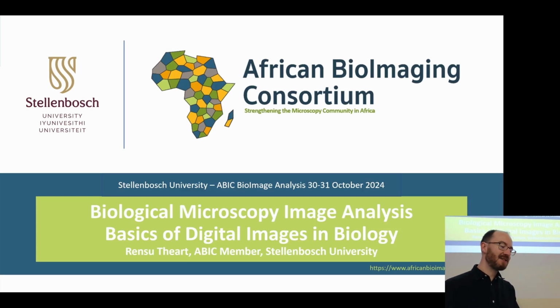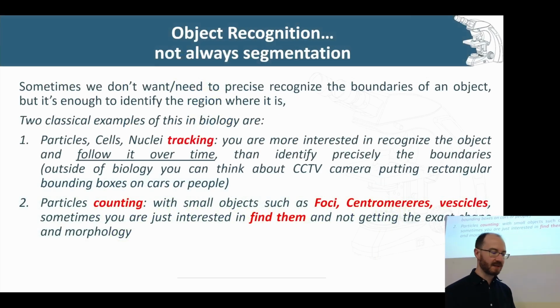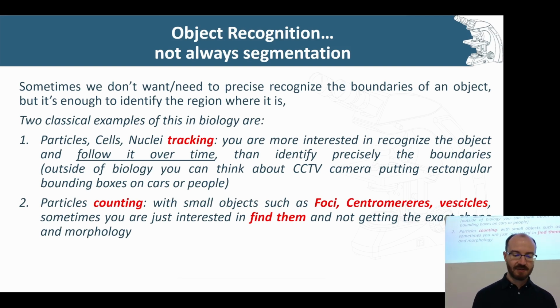Yeah, so I'm going to do one example now, and this example is associated with the work that we did yesterday, and then we'll head into new work from there. It's just a quick discussion on object recognition and tracking. There's a lot more that can be said about this, and there's no scope really in this course for that. But just to mention two applications for it.